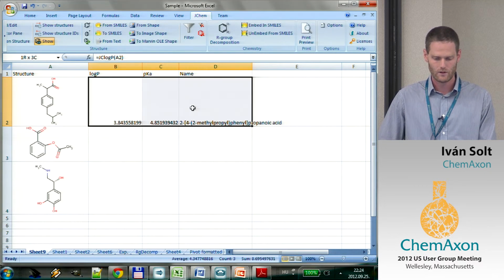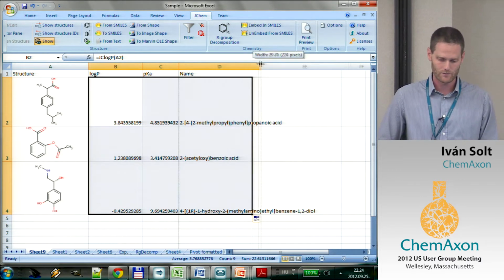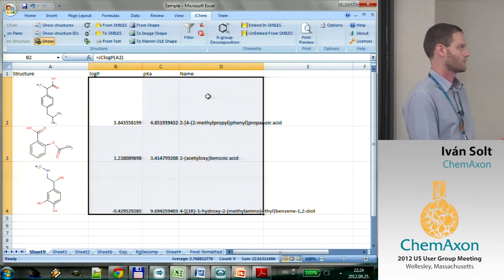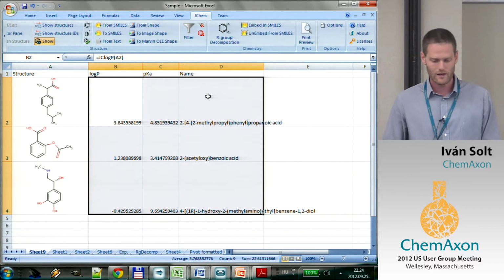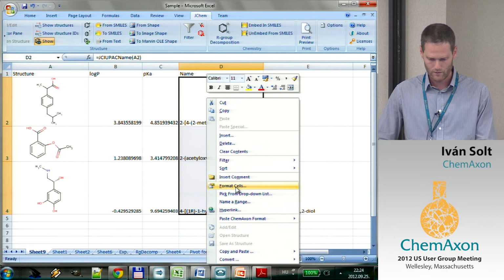Right here. And as you're used to it in Excel, you can just expand this for the rest of the structures. So it's pretty straightforward. Now, all these calculations have relatively simple return values, but you can actually add more complex return values here. Let me just wrap this.